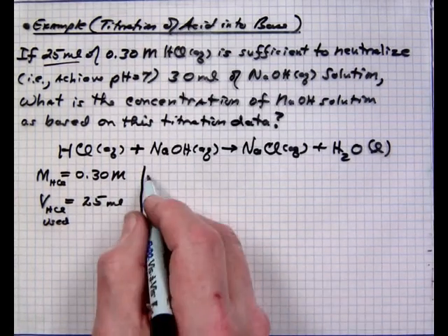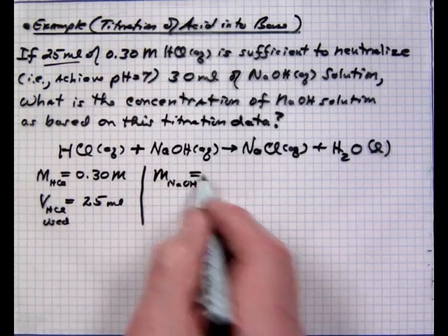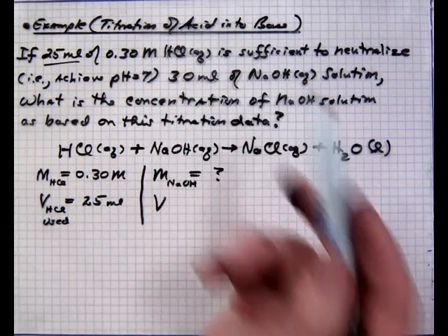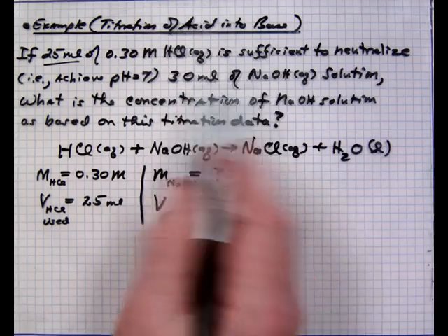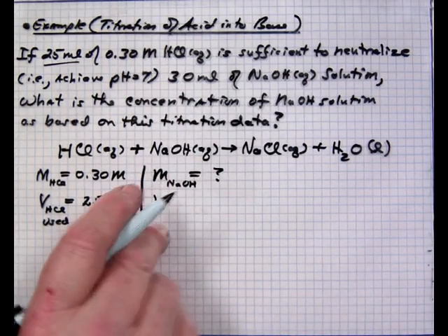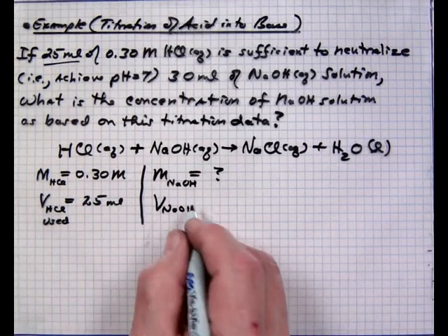Now, for the base, the molarity of the sodium hydroxide is the object of the problem, and it's certainly unknown. You prepare a solution of your sodium hydroxide and you measure out, and I just chose 30 milliliters of the sodium hydroxide solution.